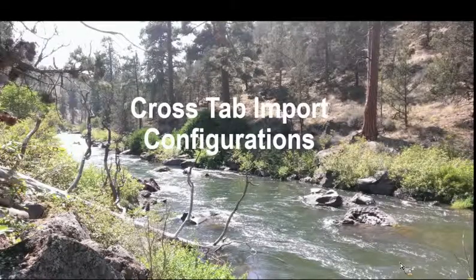My name is Laura Shumway. I am on the Storette team at EPA, and today I am going to talk about crosstab import configurations.